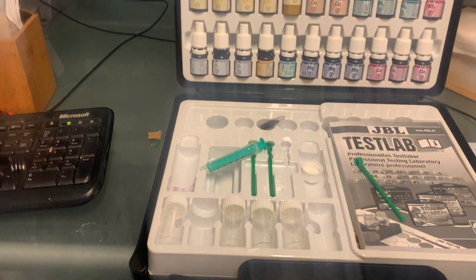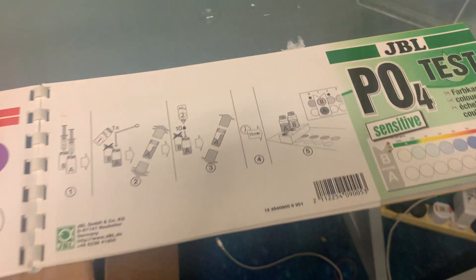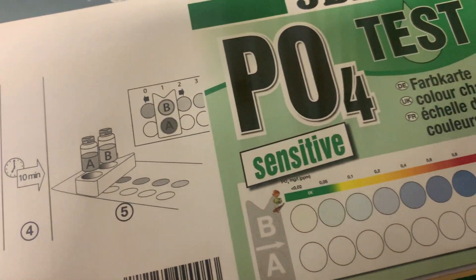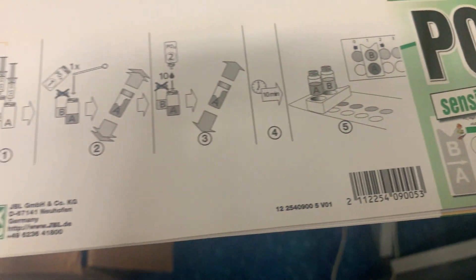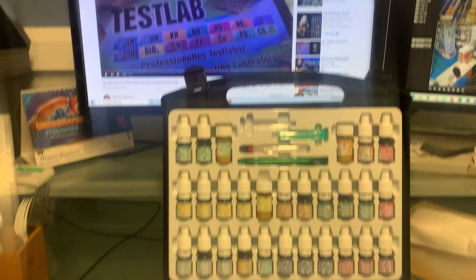I'm going to show you how to do a JBL phosphate test. This is the sensitive phosphate test. You can get it in an individual packet, or you can get it as part of a JBL test lab.